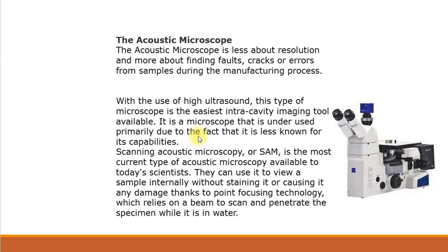So from these different types of microscopes, as we compare from the very first, the compound microscope or the dissecting microscopes, the advanced technologies created such microscopes that technically are really very useful for research, and they work efficiently, meaning less time is required for getting results from these advanced microscope techniques.